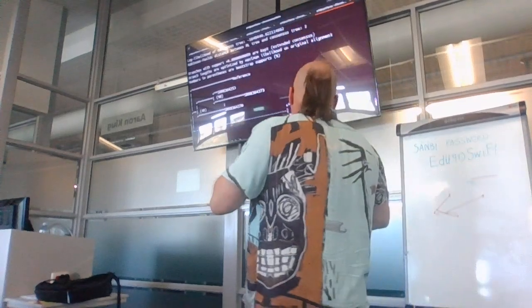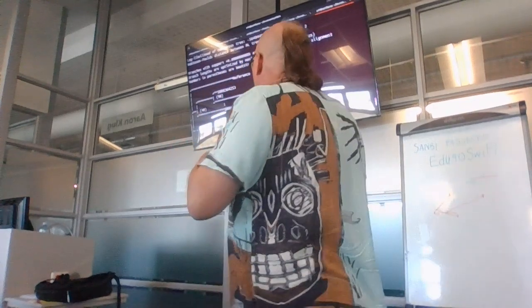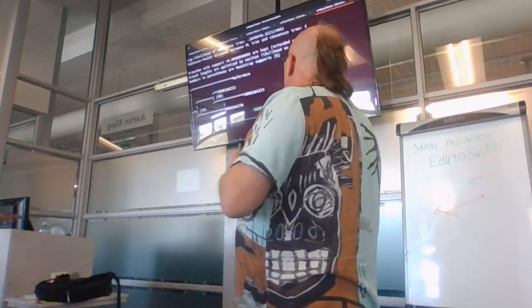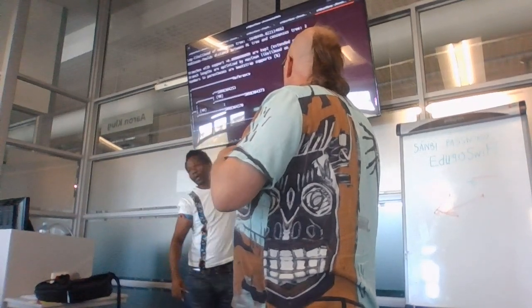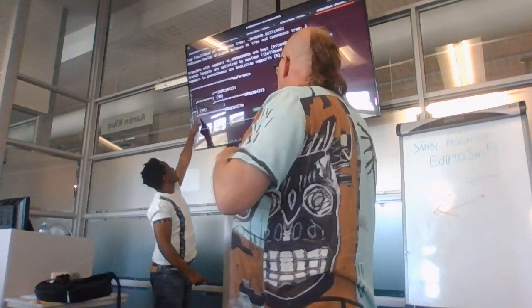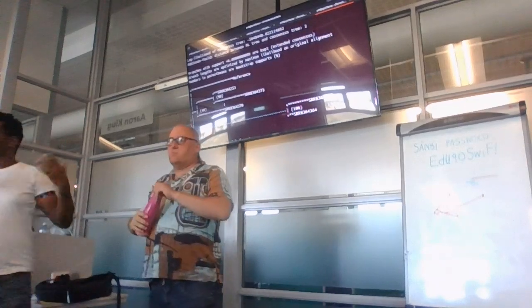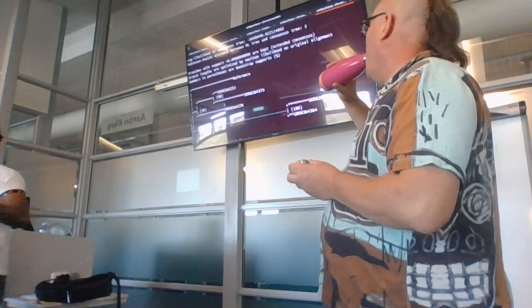It could also mean, for the one with the 40, that you have a lot of missing sampling points, because as you can see, we only have five samples: 1, 2, 3, 4, 5. It's very clear that this is not part of this going all the way back, but then we can't place this one. It's more likely to be related with this, but we have a lot of missing data. Everything in between here is missing. So you could ask EPI people, for example, a public health officer, did you collect samples from all locations?